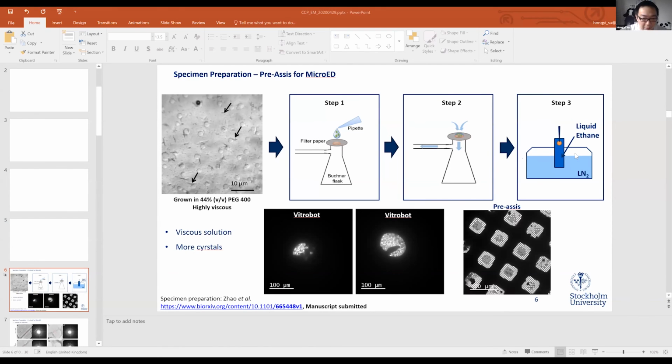Yes, we haven't worked on any sample that has been oil conditioned, but it will be very interesting to try. I think it should work. We are working now with LCP crystals and lipid sponge phase, at least. And we are also looking at the possibilities to work with mitochondria samples, and it works very well. So yes, it will be very interesting to try oil samples.